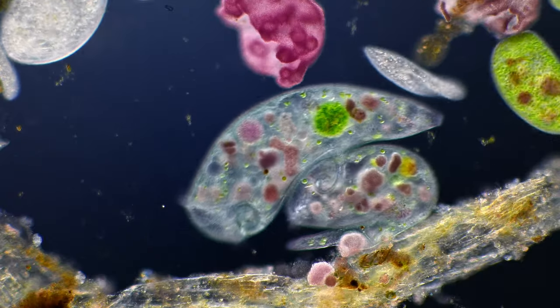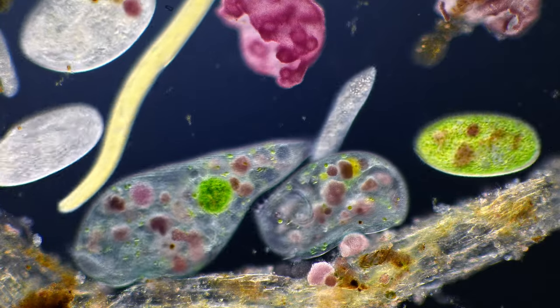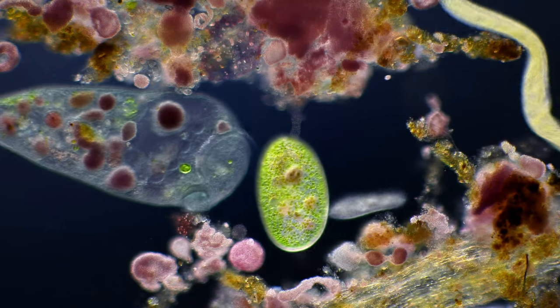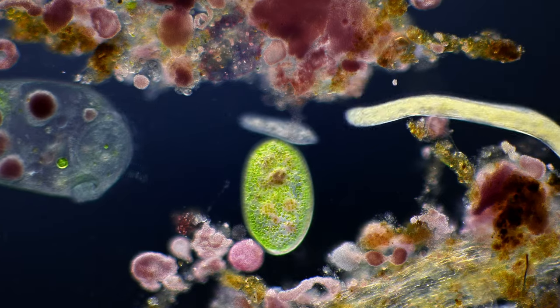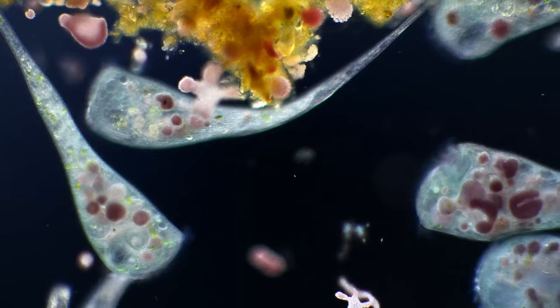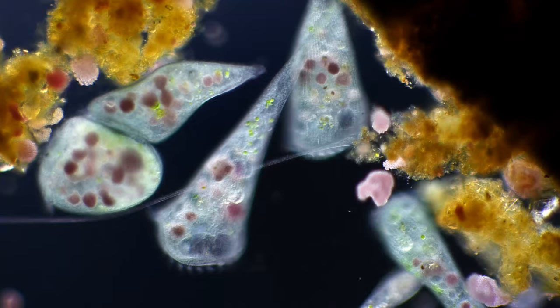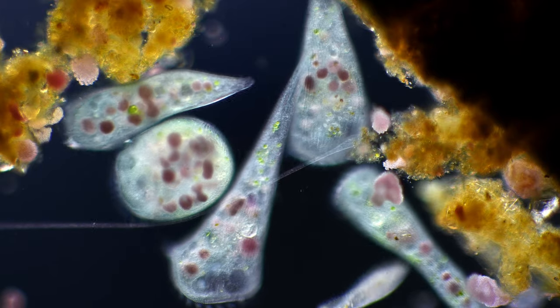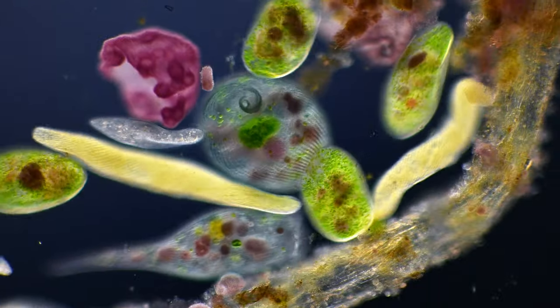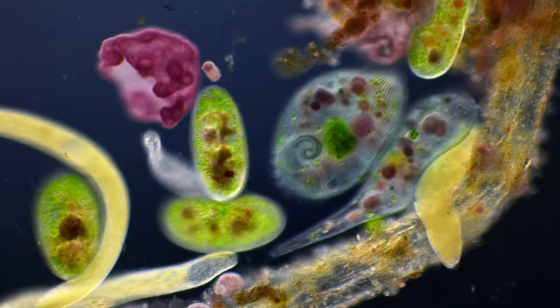These two large bluish cells are called stentors, and they are some of the biggest single-celled organisms on the planet. They move and feed using tiny beating hair-like projections called cilia. The cilia create a flow of water and food particles towards the front end of the cell where it can be ingested. Inside each cell, we can clearly see the different ingested materials, where it is currently being digested. Stentors are also known as trumpet animalcules, due to their trumpet shape when stretched.